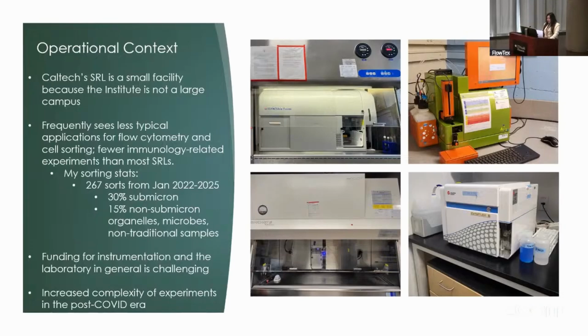I know that testing the instrument takes troubleshooting and extra staff time, which is a shared challenge in every SRL, regardless of the sample type. But in submicron sorting, the added risk is that the instrument is not guaranteed to outperform the existing ones, despite theory around newer instruments with APDs being more sensitive. Nothing comes without exchanges and compromises. And then of course, theory versus practice.